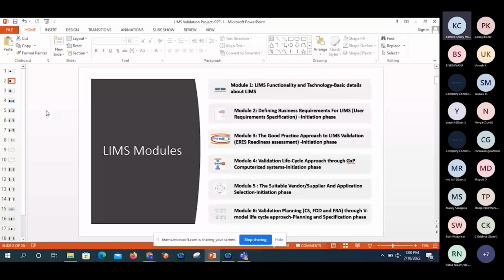How? By installation qualification, IQ. For example, this stability module has some patches. These patches will be provided by the vendor. The same thing will be deployed in the development environment, and in validation as well. The same thing will move to the production environment by writing test protocols. The test protocol contains the test script. In the test script, we will say the steps, whatever the patches are, this is the description, this is the expected result, this is the pass or fail.